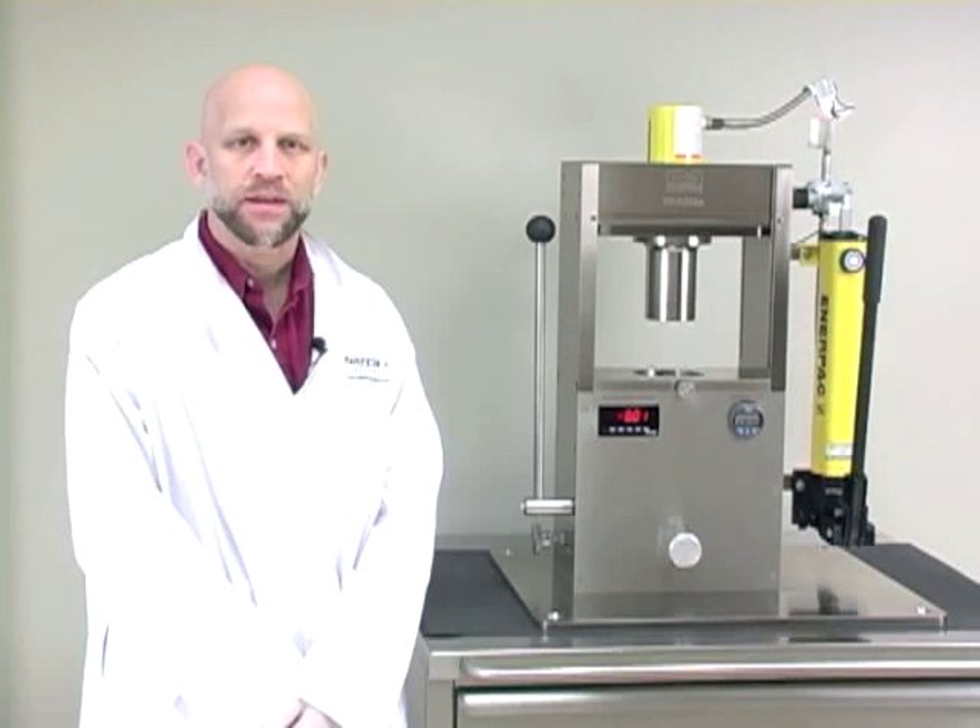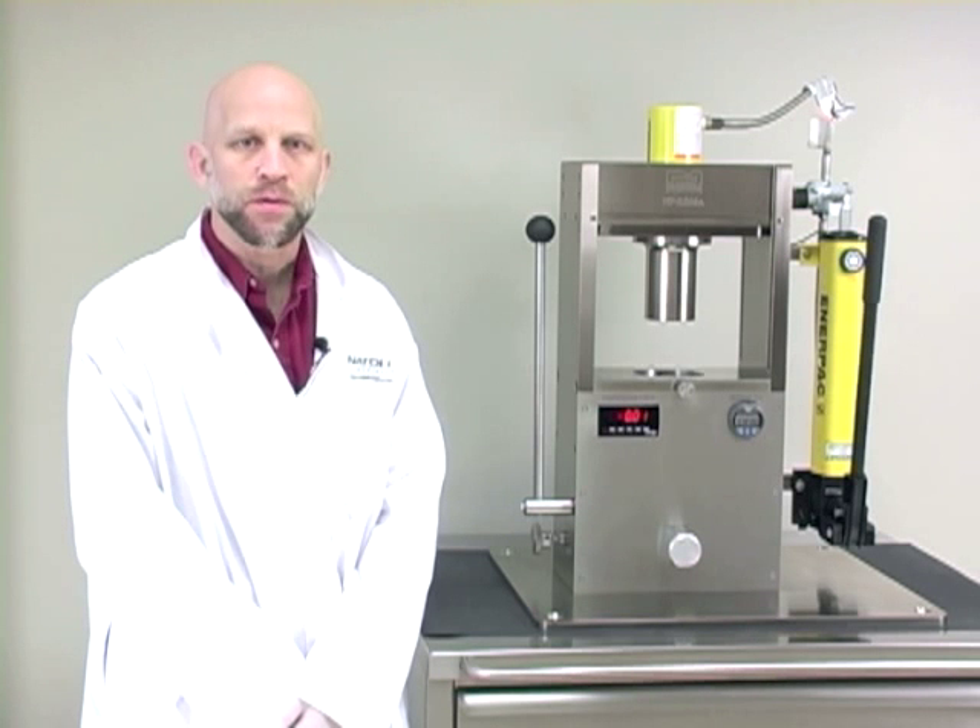Hello, I'm Chris Fulkerson, Technical Services Engineer with Natoli Engineering. Today we're going to review the features and operations of an NPRD-10A laboratory tablet press.